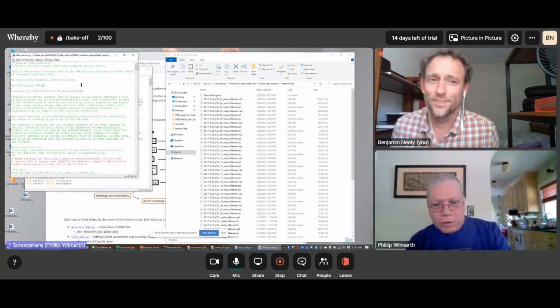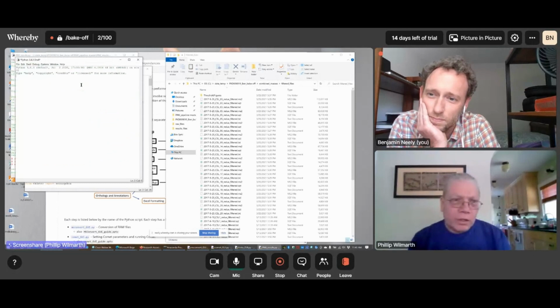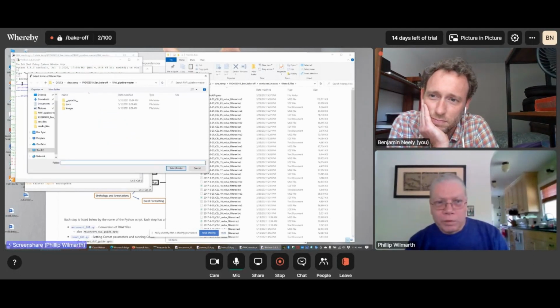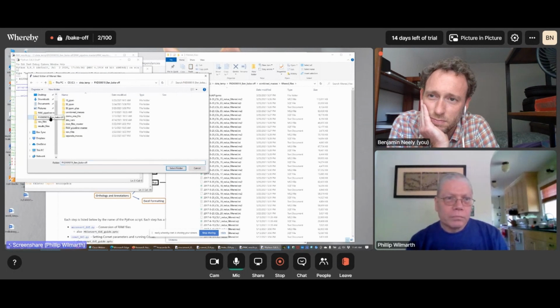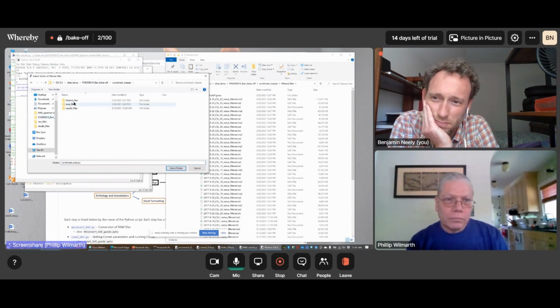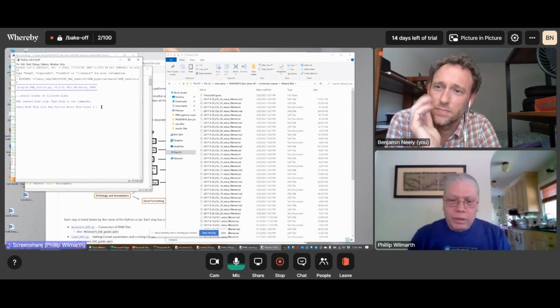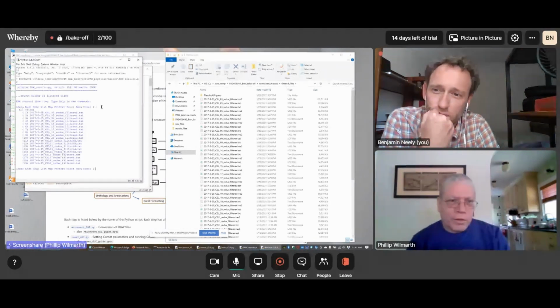Okay, so now the results program is going to read these filtered files and do the protein inference. So it asks us to select a folder with the filtered files. And it's read in all of the top hit summary files in that folder. We can list what's there. There's the 19 raw files.